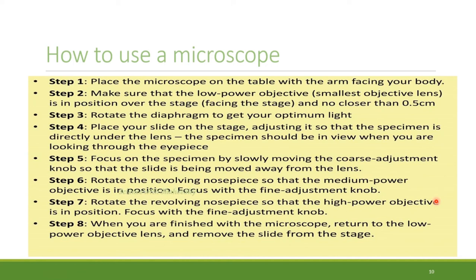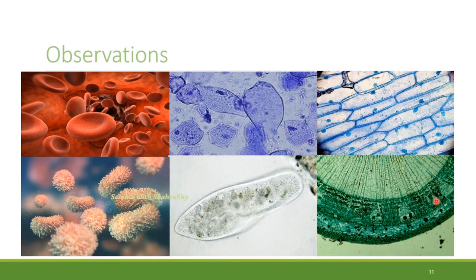Finally, when you are finished with the microscope, return to the low power objective lens and remove the slide from the stage. This is the way we have to use a microscope while we are working. Now let's move on. What about the observations?